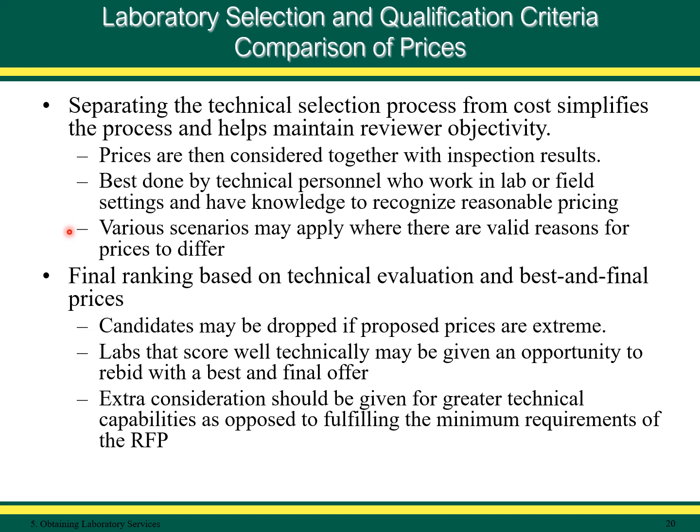There are various scenarios where it may be appropriate for prices to differ. The final ranking is based on technical evaluation, including proficiency examination and audit, and the best and final prices submitted by each laboratory. Candidates may be dropped, generally, if the proposed prices are extreme. Laboratories that score well aside from their prices may be given an opportunity to rebid with a best and final cost.